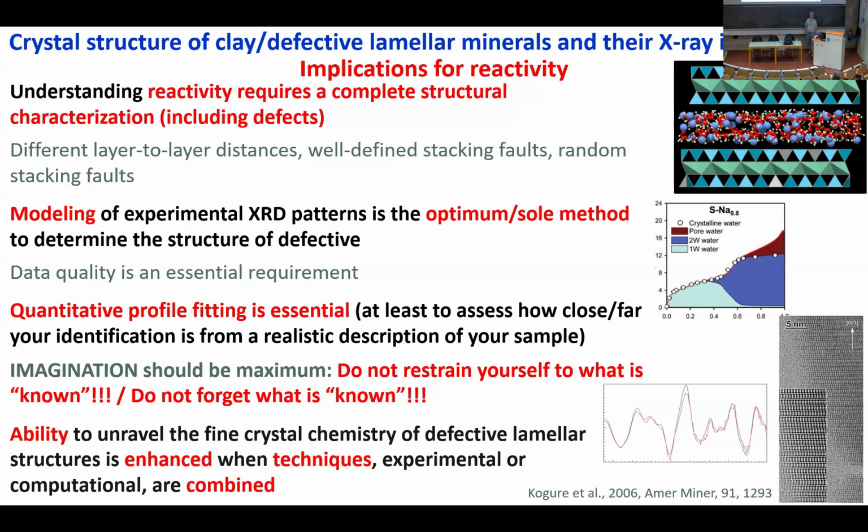Getting information about what is actually the nature of cations in your smectite, I guess, will be extremely complicated from an X-ray diffraction point of view. One simple reason, and there are more complex ones, is that what X-rays are seeing is essentially electrons, which means that they will see exactly the same thing looking at 2 sodium or 1 calcium. They will see 20 electrons, period. And differences you may expect are too minor to be measurable.